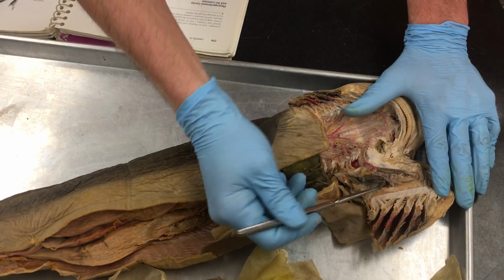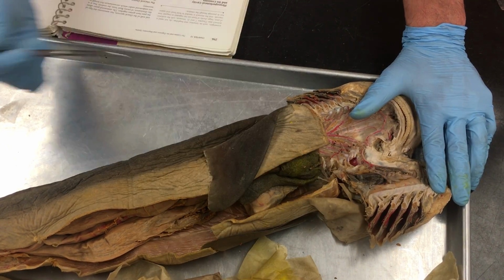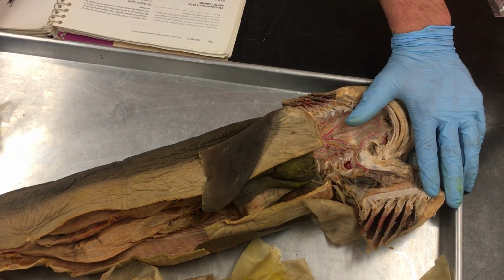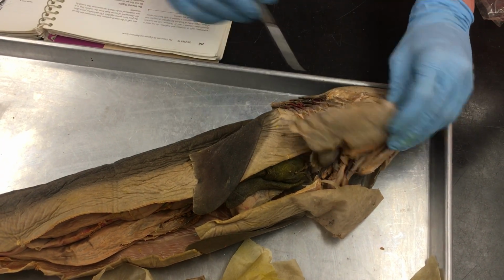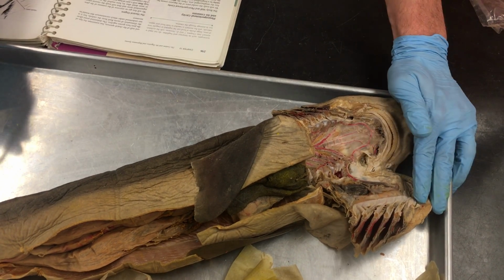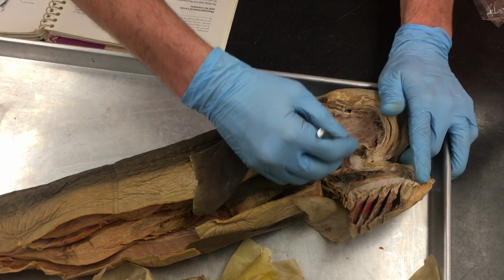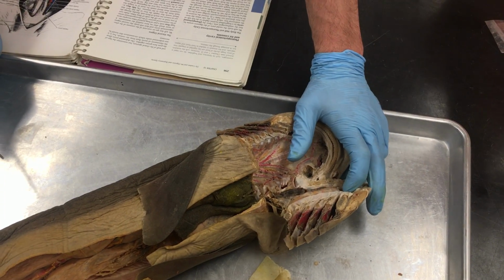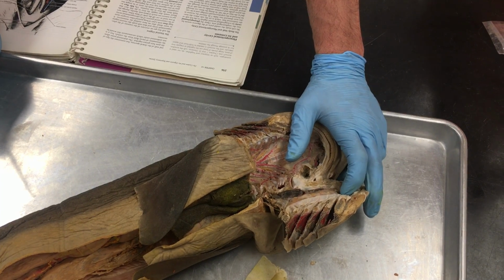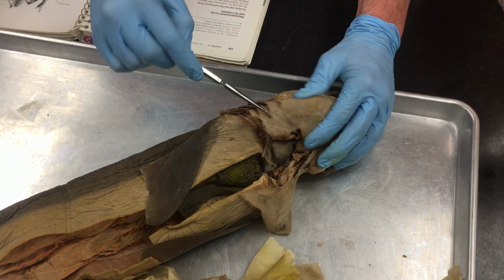The primary tongue was cut out to get the ventral aorta, but the primary tongue would have been here. Oropharyngeal cavity, this is just the mouth cavity, just the space. Teeth. Spiracle, you can find it inside and outside. Gill slits, so internal gill slits, external gill slits.